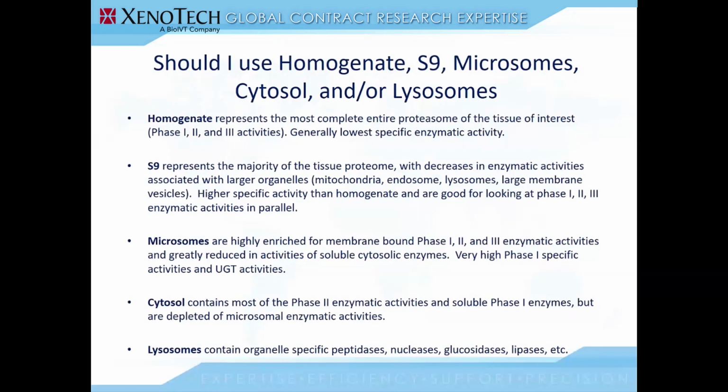and PMSF-free subcell for esterase activities. Lysosomes and tritosomes are for compounds or molecules that in vivo are expected to be endocytosed from the cell surface and trafficked to the lysosomes.